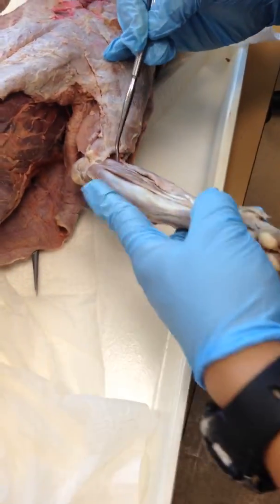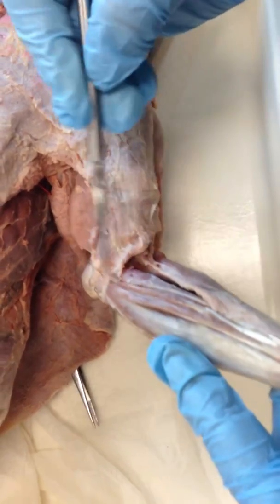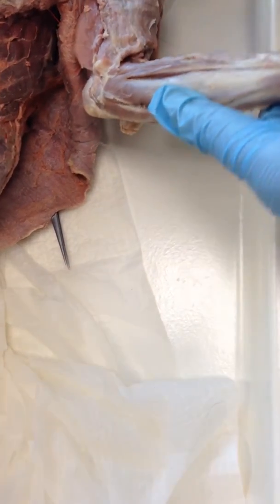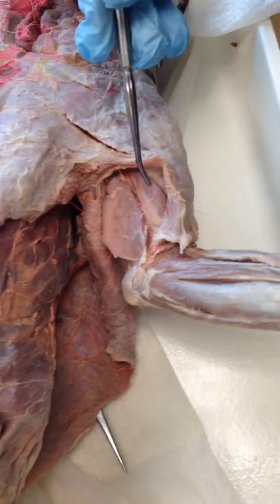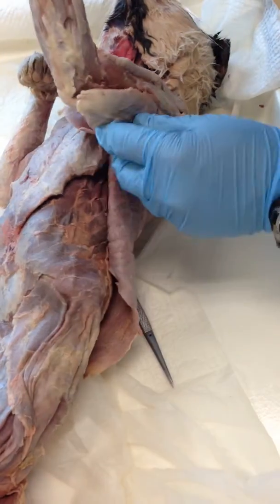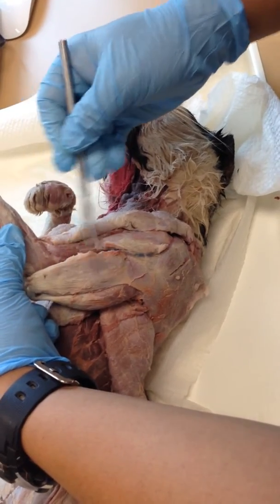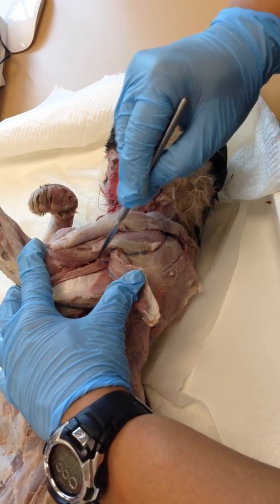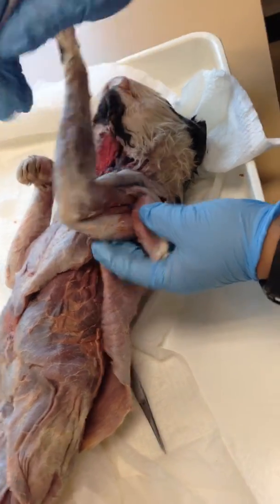After that, the pronator teres is right next to it. This is the pronator teres right here, the small muscle right here. And it's right next to the flexor carpi radialis. Biceps brachii is located internal, right there. The triceps are right here. Triceps brachii. The lateral head is this one. The medial head is right next to the brachialis. This is the triceps medial head. This is the triceps brachii long head.